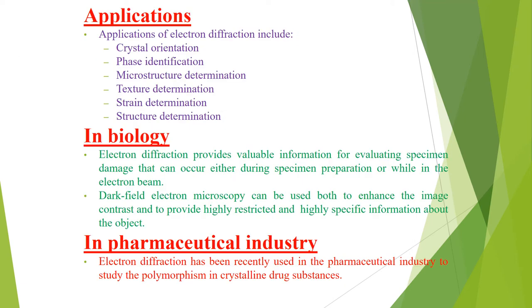Here are some applications. The applications of electron diffraction include crystal orientation, phase identification, microstructure determination, texture determination, and strain determination. Structure determination is also one of its applications.